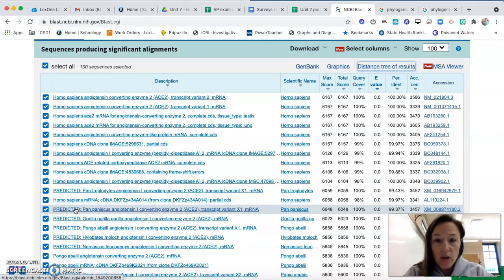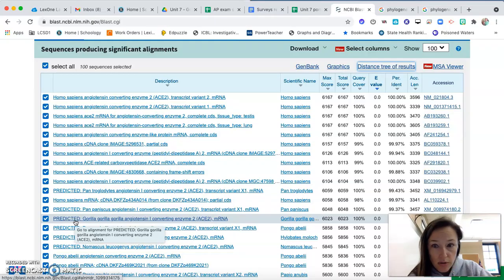And then you can also look at the percent identical. So that's 99 if you need, like if these are both 100, and 99.37. So there is a little bit more identicality, I don't know what word, with this one. And then the next one is gorilla, which is shockingly the gorilla. And that's also at 100% and at 99.22.